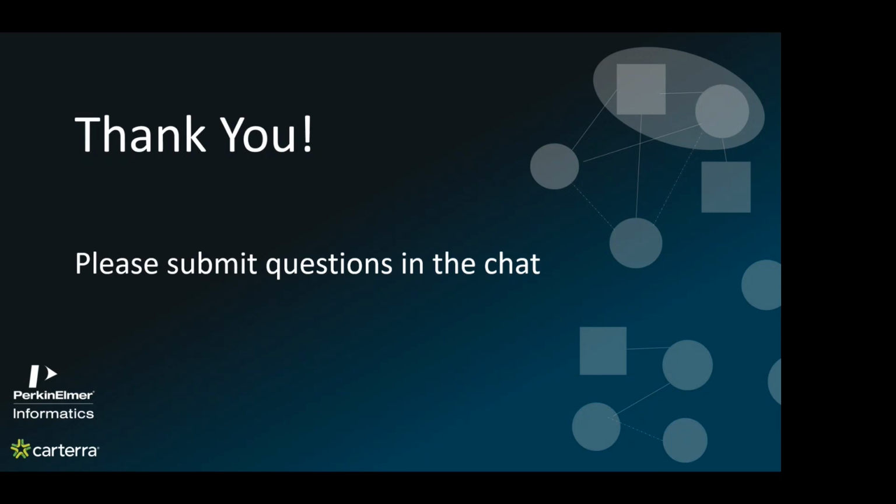Thank you. We have kind of a long one here. If we collect data for kinetics from crude preparations and later in the project screen kinetics of purified monoclonal antibodies, is there a risk of affinities not agreeing between the two approaches? Yeah, that is a good question and a concern, particularly in early discovery, selecting candidates and moving them forward. If affinities change, at least in terms of what they're measured as, that's problematic for decision making. The short answer is no.